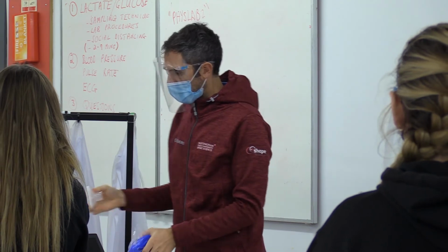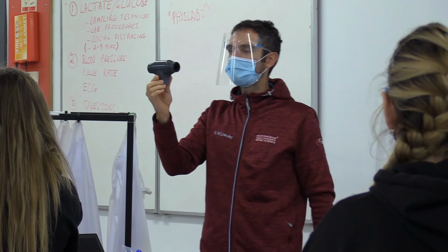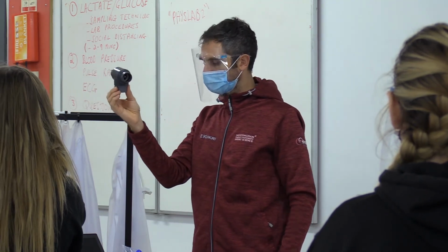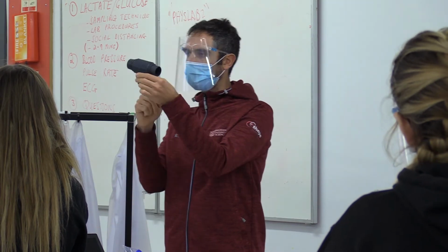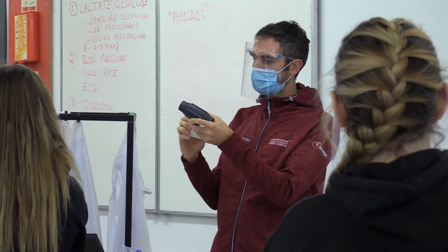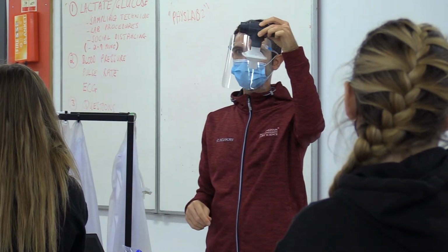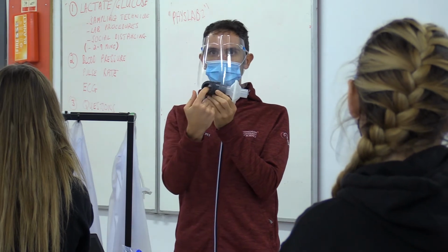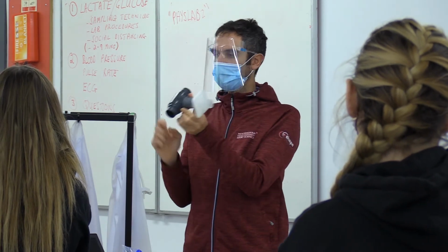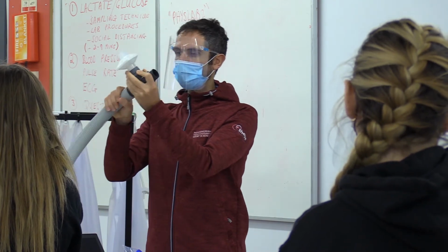Okay? Then we have this piece of equipment called a two-way valve or a T-valve, for obvious reasons. If you think of it as a capital T, the bottom part of the T is the bit that attaches onto the filter. So that should be a really sort of tight, snug fit. But if you look really carefully, you have a bit that you can almost poke into and a flat bit. The flat bit needs to go onto the bottom of the tube.